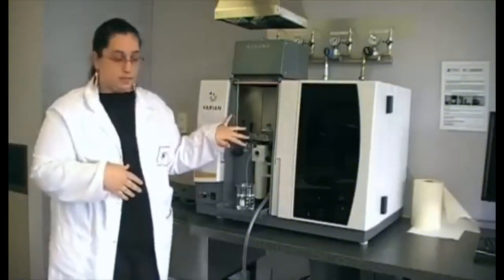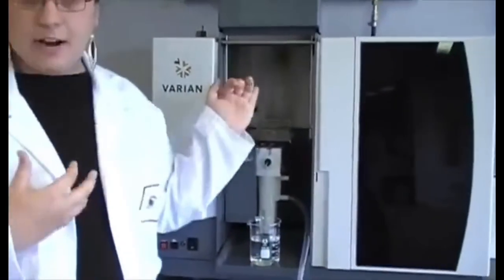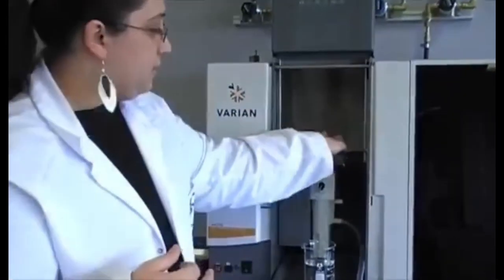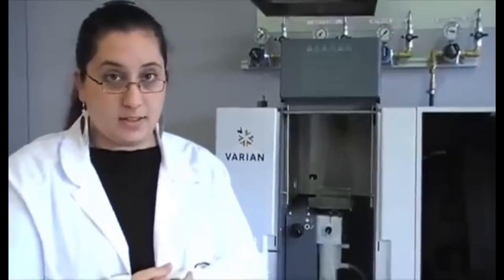Those droplets created by the nebulizer are moved using carrier gases into this burner slot, which is where the flame is. So the gases have two roles. Their first role is to sweep your sample of droplets into the flame, and secondly, once they're in the flame, to act as a fuel, so that our flame happens at very, very high temperatures, over 1,000 degrees and above, depending on the mixture of gases that we use.